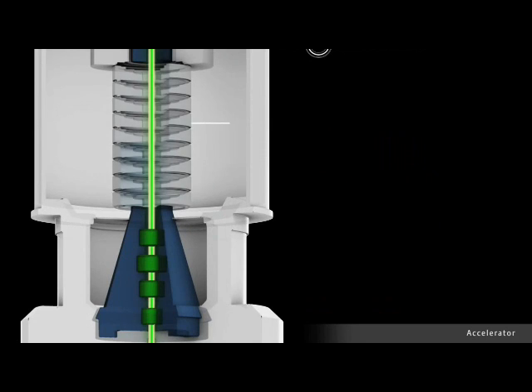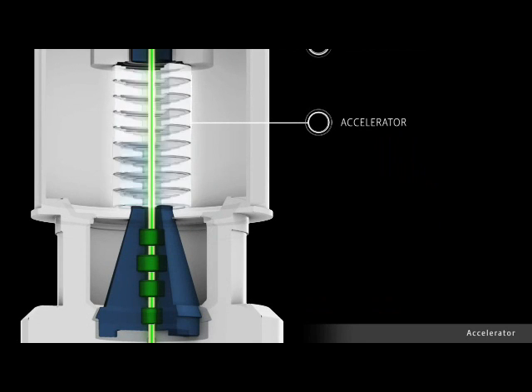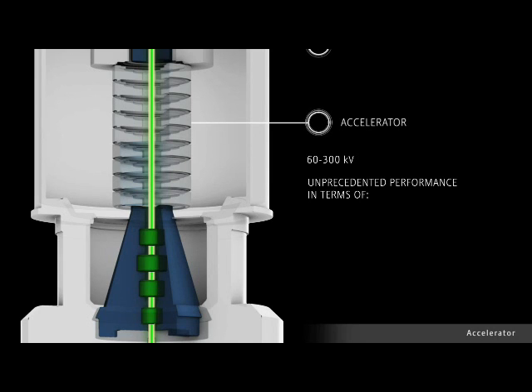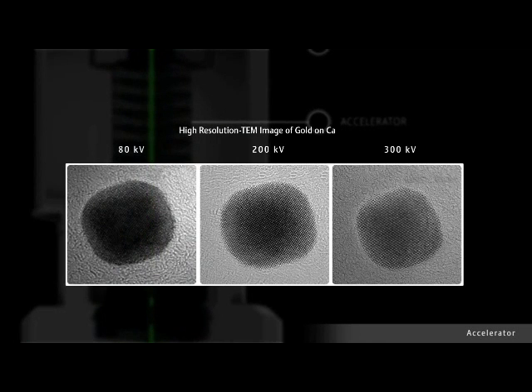Beyond the monochromator is the accelerator, with the broadest commercially available acceleration voltage range of 60 to 300 kilovolts. The accelerator's voltage range provides unprecedented performance on any material in terms of penetration power for dense material, high contrast for light compounds, and in minimizing knock-on damage of beam-sensitive samples.